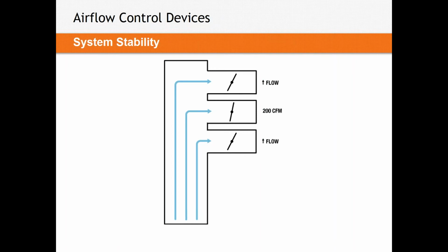For an instant in time, your fan is running at a set speed, and all of that airflow is being pulled through a smaller orifice than it was before. So momentarily, your flow must rise through that fume hood. The goal of any fume hood is to meet what the manufacturer of the hood says and hit a certain flow at a certain sash position. So momentarily with closed loop valves, you cannot attain that. The fan can be turned down, but more importantly, those other 2 valves can open or close to accommodate that change. But that change takes time.